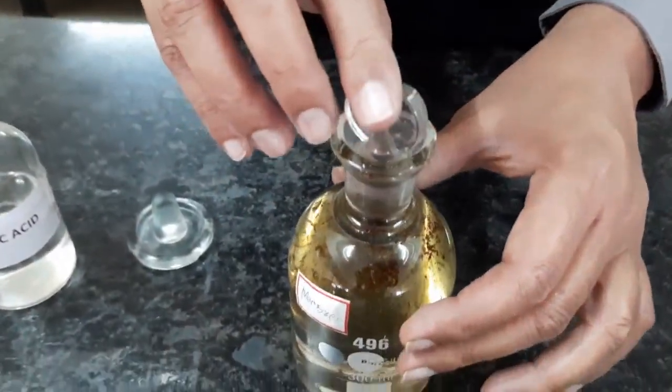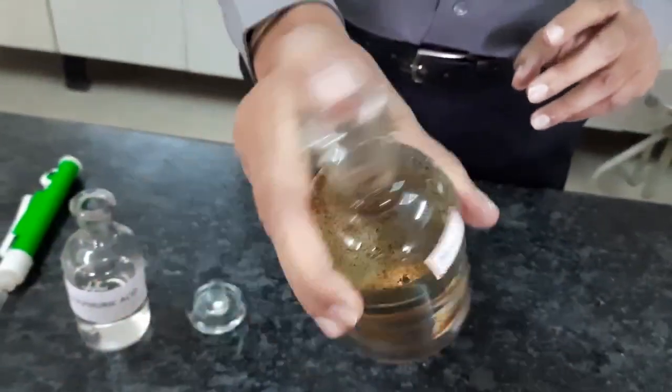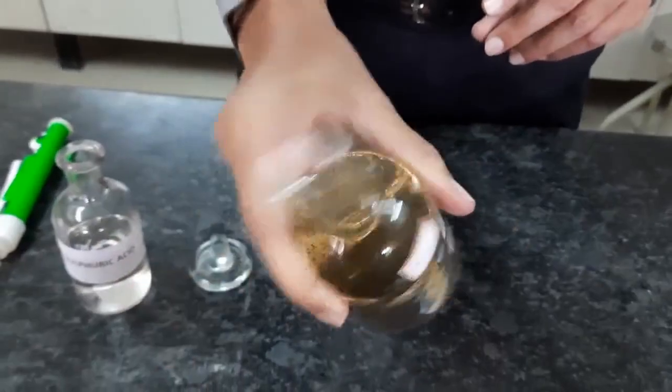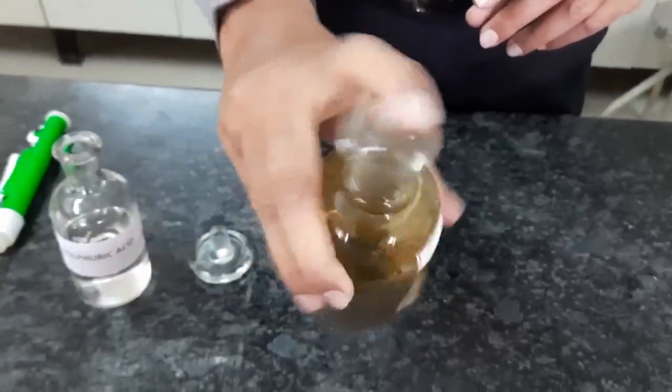The BOD bottle is now closed, and you need to mix it, because the addition of H2SO4 should dissolve the precipitate that is formed.